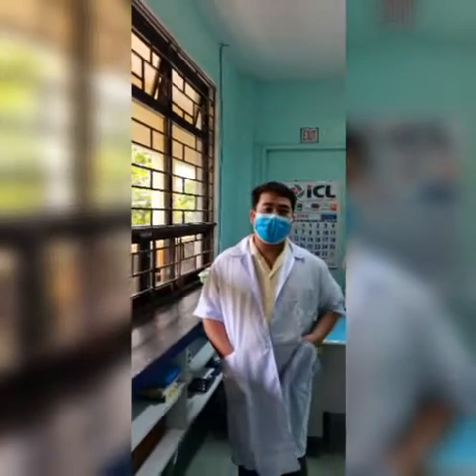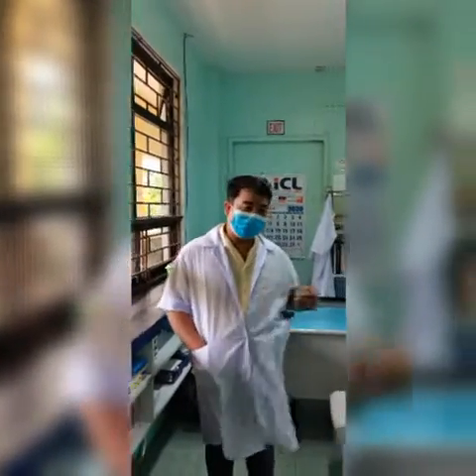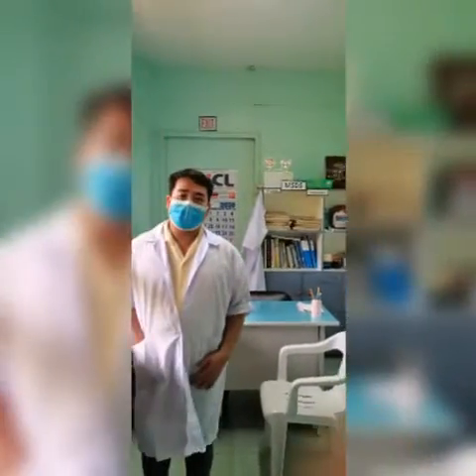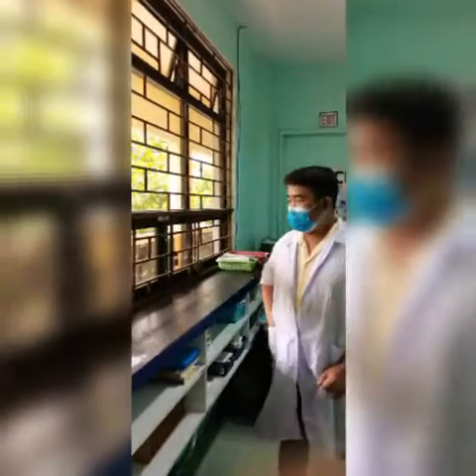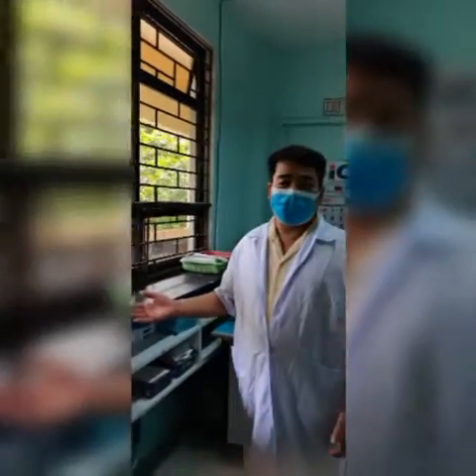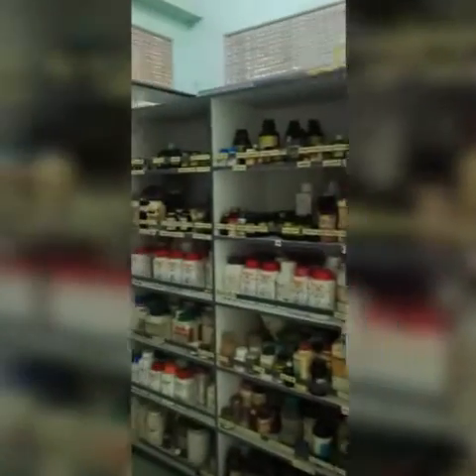First off, may I introduce you to the office of the chemical section in charge. It is where the chemical section in charge stays in order to accommodate students and faculty. And also at this area is the counter where the releasing and reservation of chemicals actually occur. And inside, you can see the arrangement of chemicals.